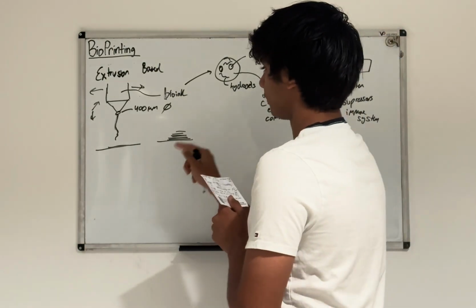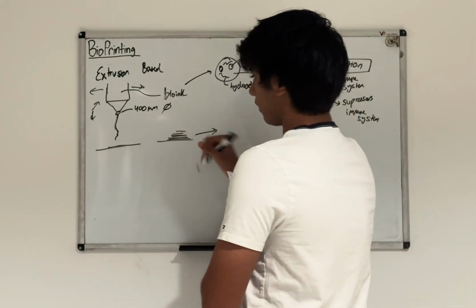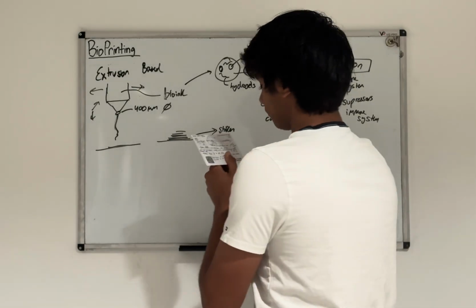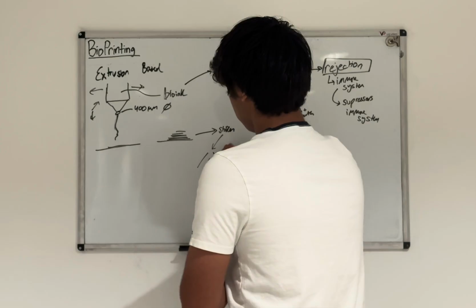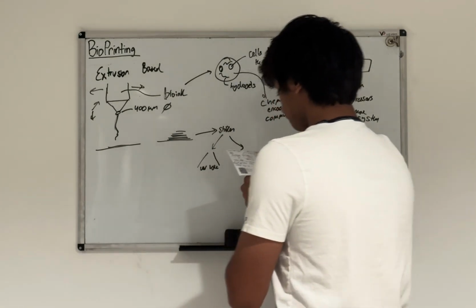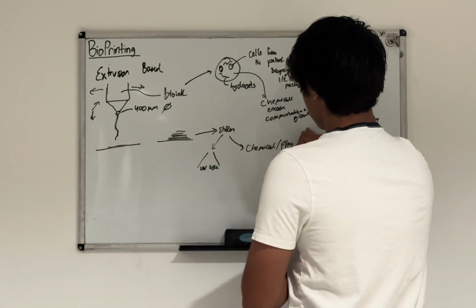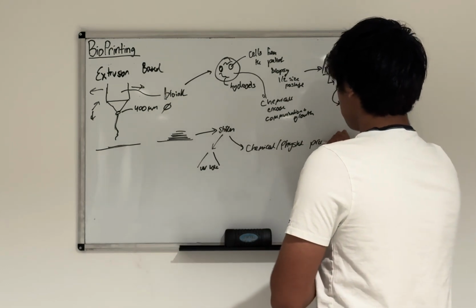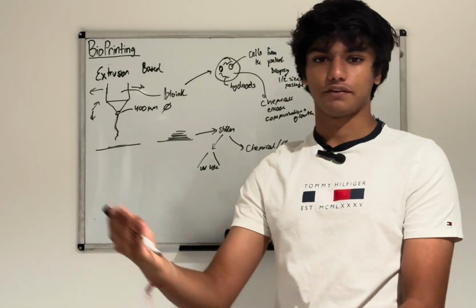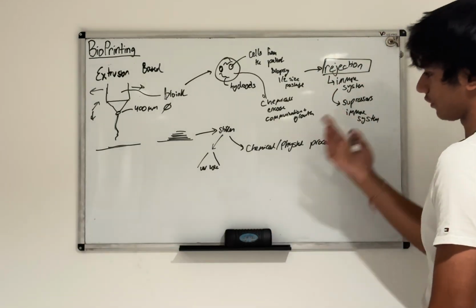And so once this material is printed on the dish, what you have to do is make sure that it stiffens. Some bioinks automatically stiffen, so you don't have to do anything to them. But others, you have to add a UV light sometimes to make them stiffen, or you have to use chemicals or physical processes like cooling it to make it stiffen. And then the idea is once you stiffen it, there you go. You have your tissue, you have your organ, whatever, and you can now use that in a transplant surgery, and you can use it without fear of rejection.